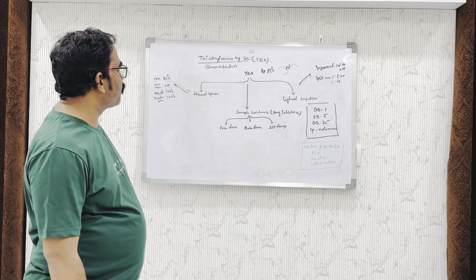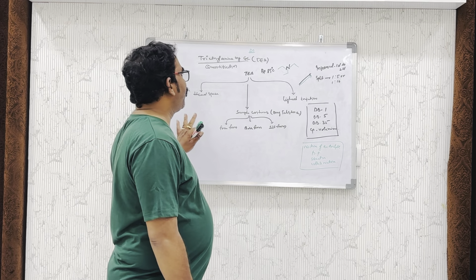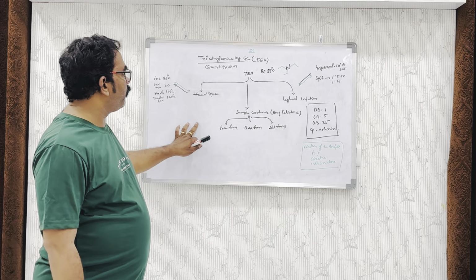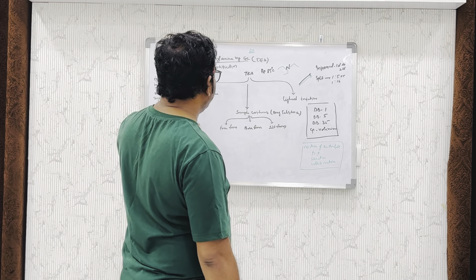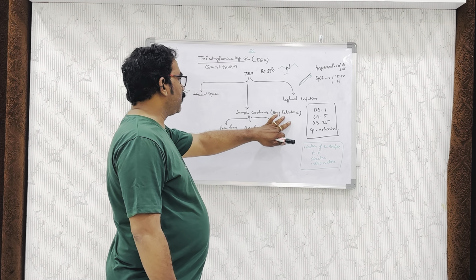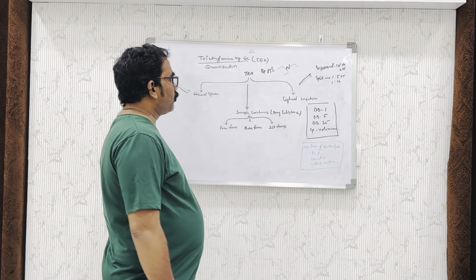Today I will explain how to quantify triethylamine in drug substance, and the same method we can apply for drug products also.